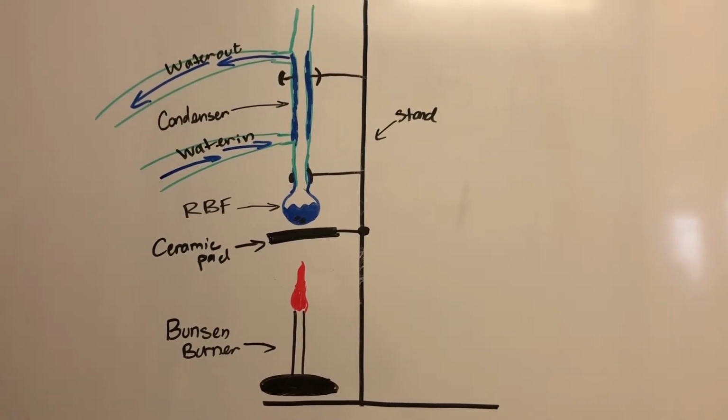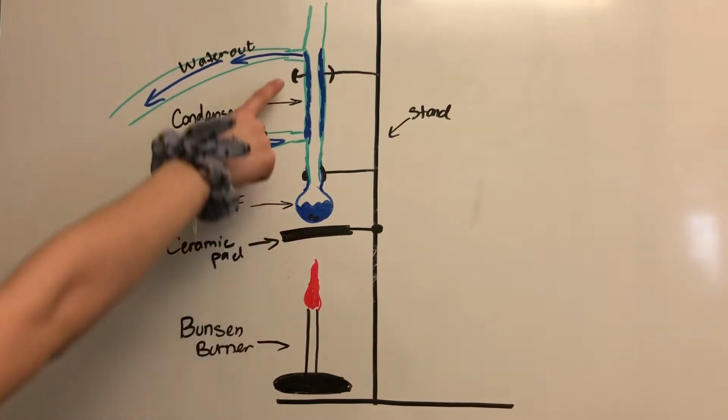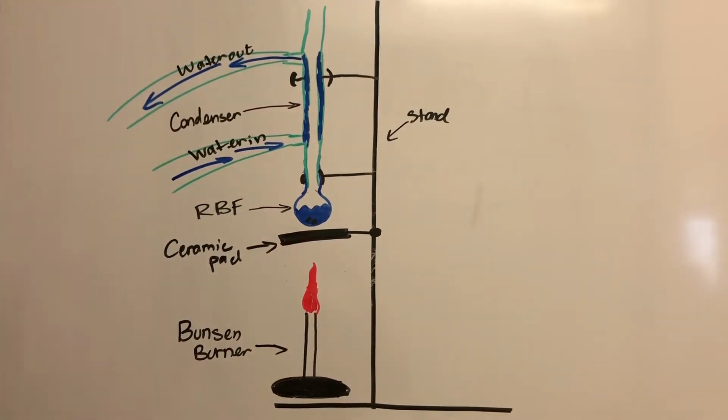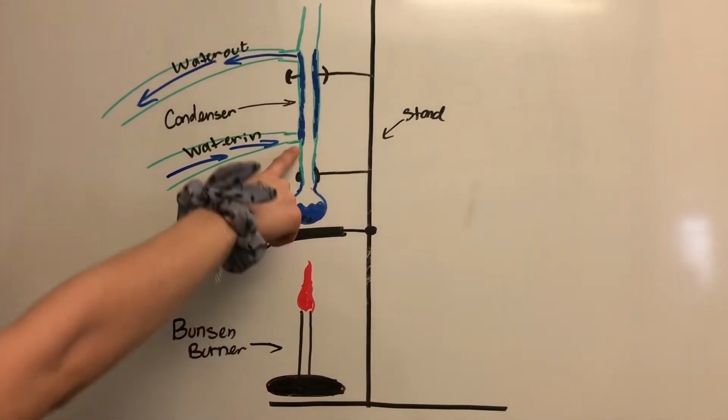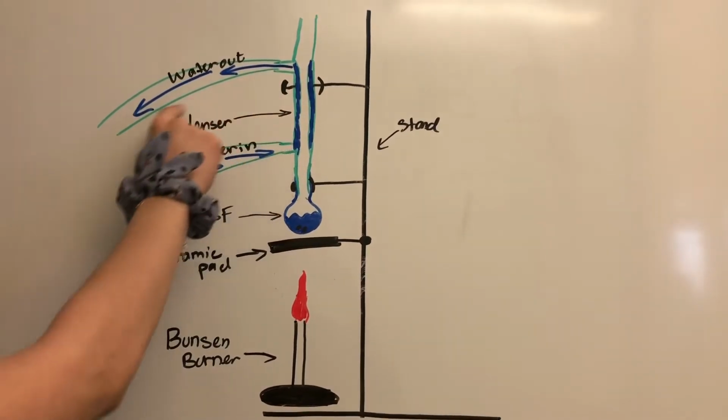In the greased opening of the round bottom flask, you want a condenser held by a loose clamp about 3/4 the way up. On this opening of the condenser, you want the cool water coming in, and on this opening, you want the cool water coming out.